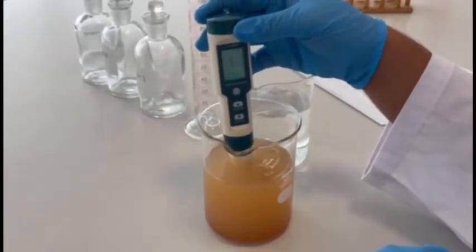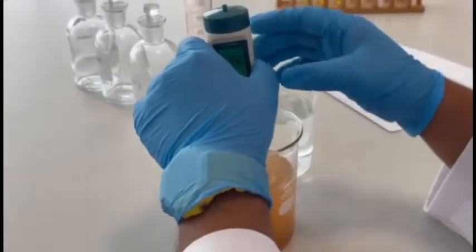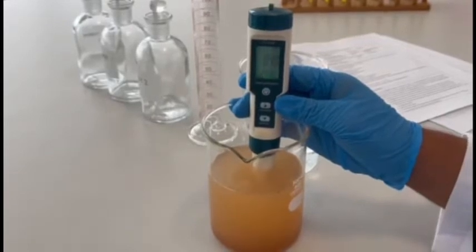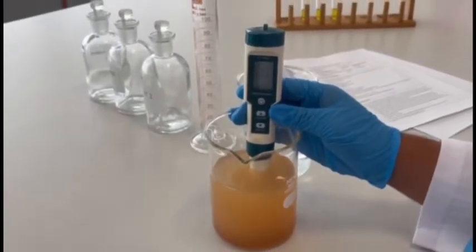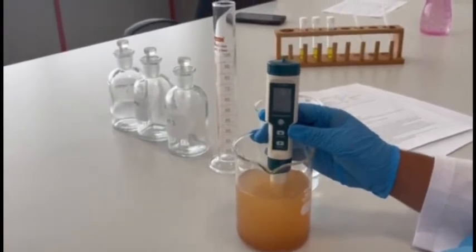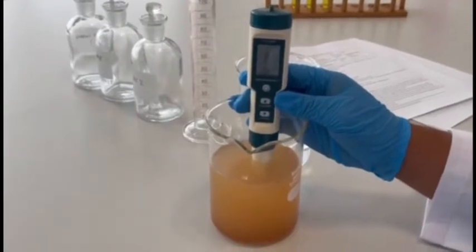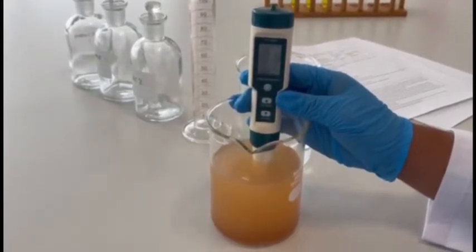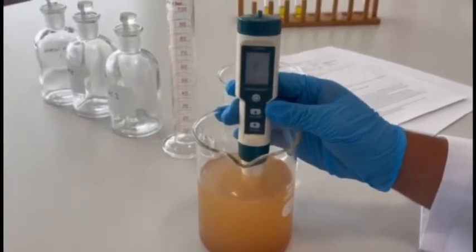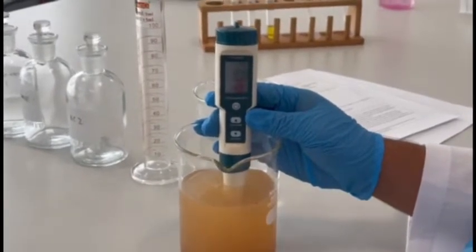Then carefully pipette 2.0 ml of sample into the vial and cap, and clean the outside of the vial. Then hold the vial by the cap over a sink. Invert gently several times to mix. The sample will become very hot during mixing.